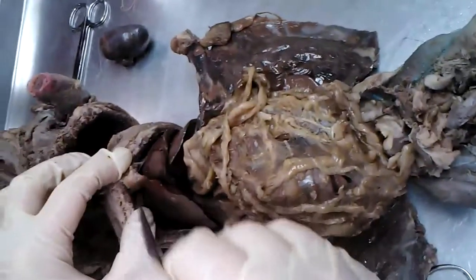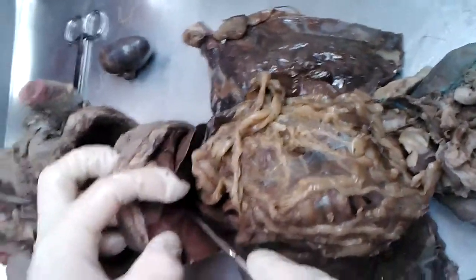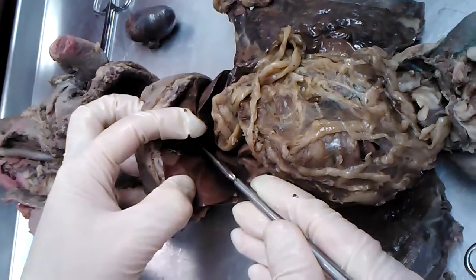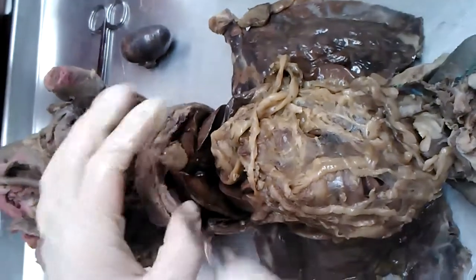Let's move on down into the abdominal cavity. Open things up here. First, hard to miss this big thing, the liver. Then hidden amongst the right lobes of the liver, this little collapsed sac way down inside there. That's the gallbladder. Kind of hard to find on this mink, but it's still there. So gallbladder is in there.